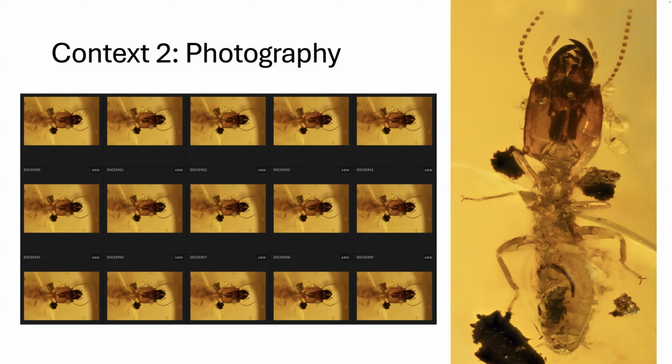And then later I realized actually you can have a machine to do that for you. And it's right here on the right-hand side of my desk. And I'm not going to turn the computer around to show you. So I've got a macro rail like this and a little box, and I tell it where to start and what increments and how many. So I might say I want 20 micron increments, I want 50 increments, and it goes snap, moves down, making sure everything stops shaking all the way down.